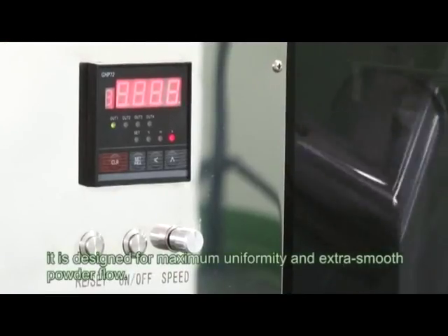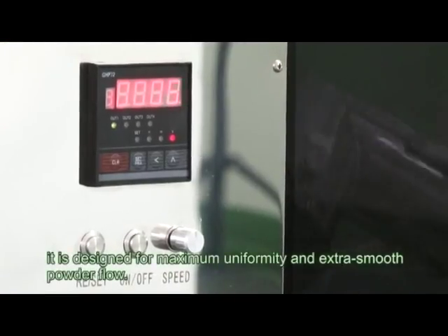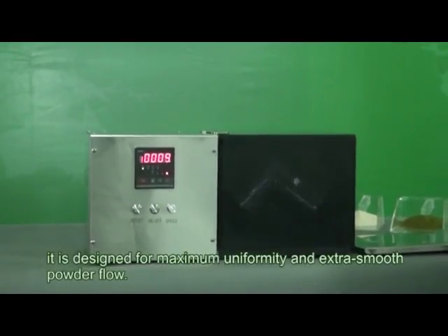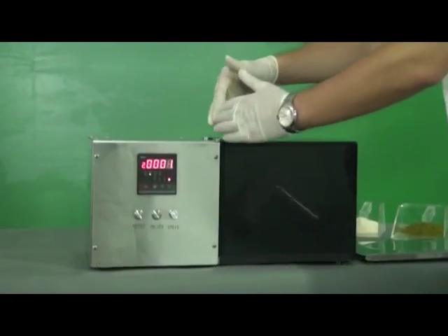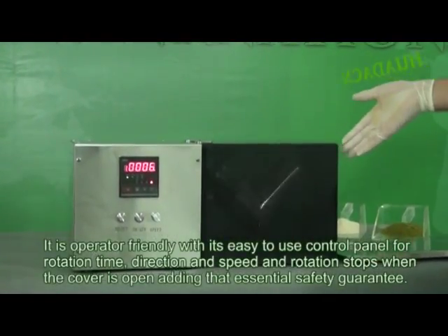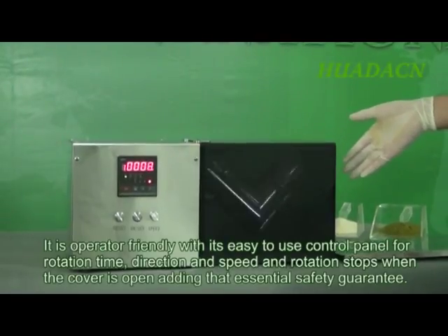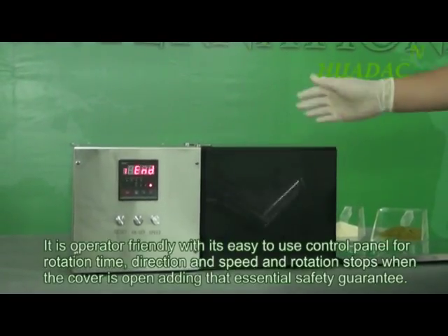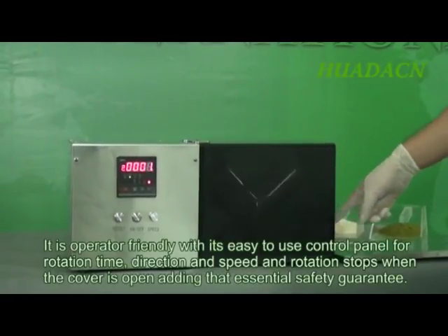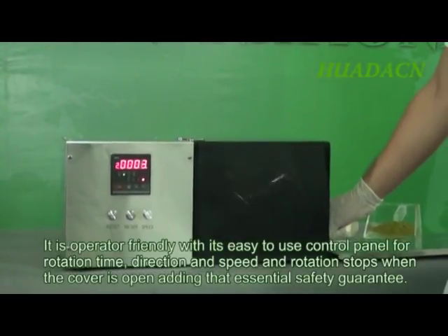Made from stainless steel 304, it is designed for maximum uniformity and extra smooth powder flow. It is operator friendly with its easy to use control panel for rotation time, direction and speed, and rotation stops when the cover is open, adding that essential safety guarantee.